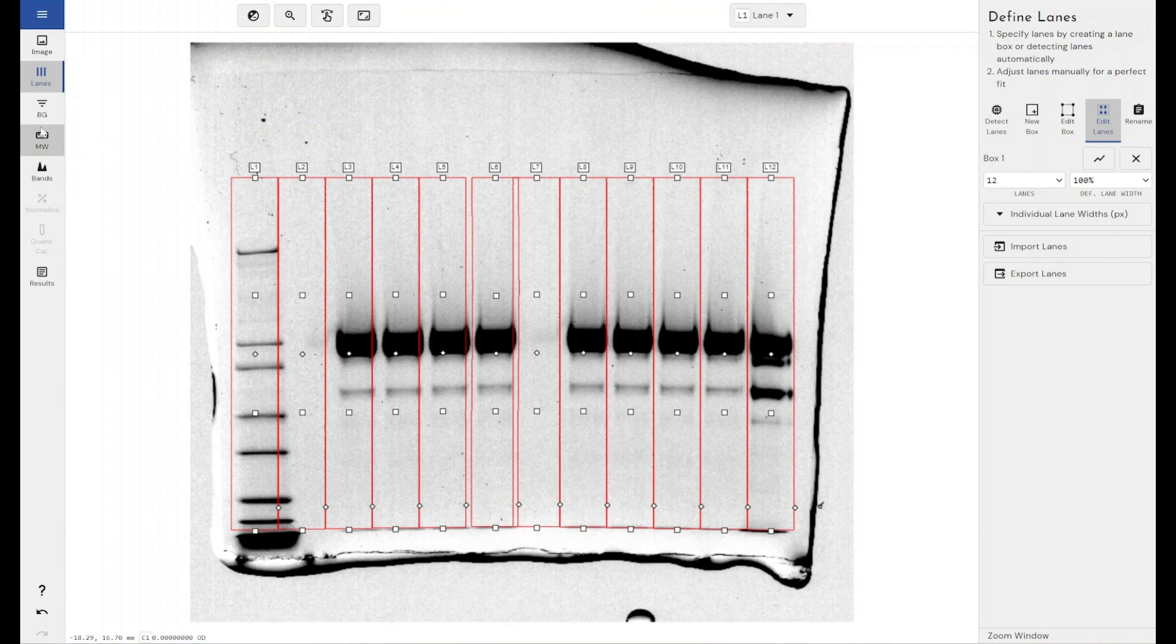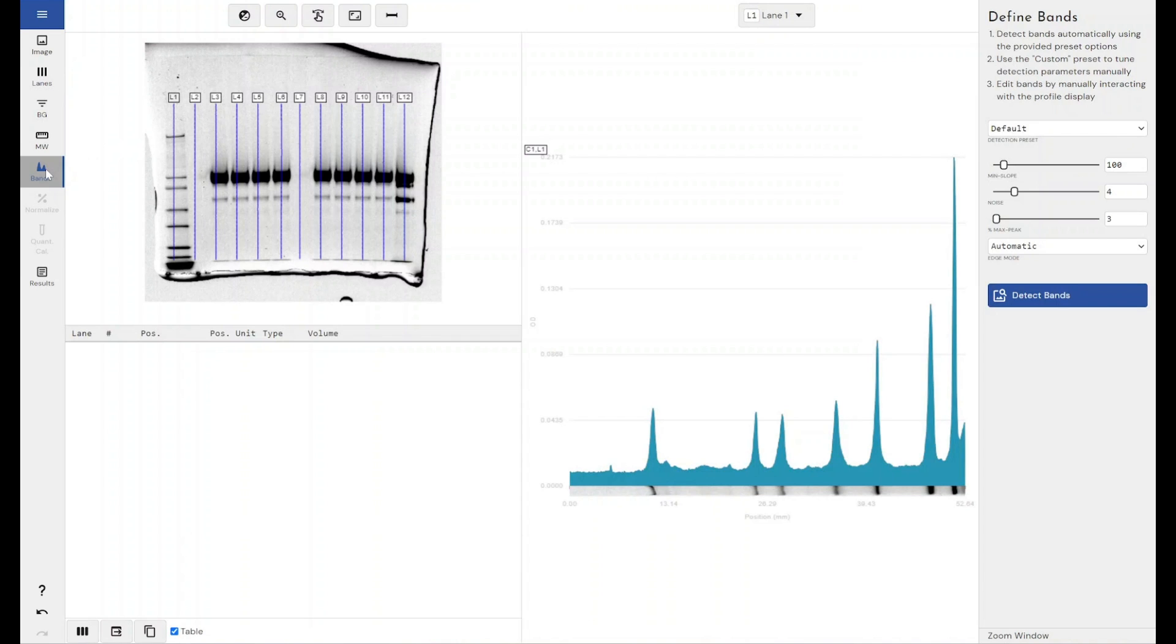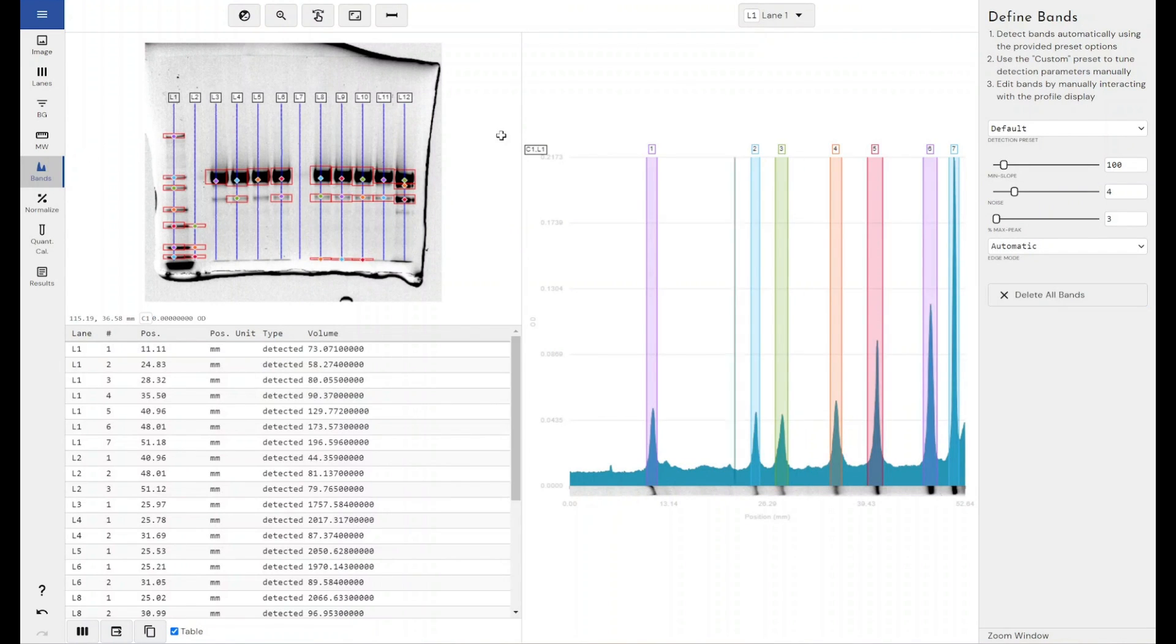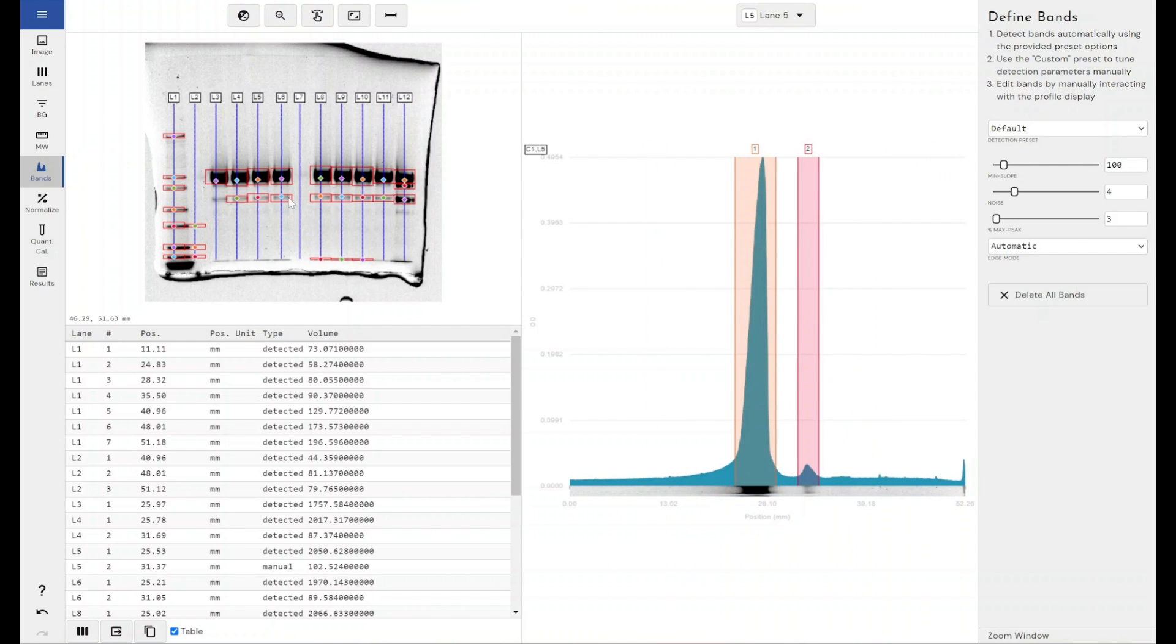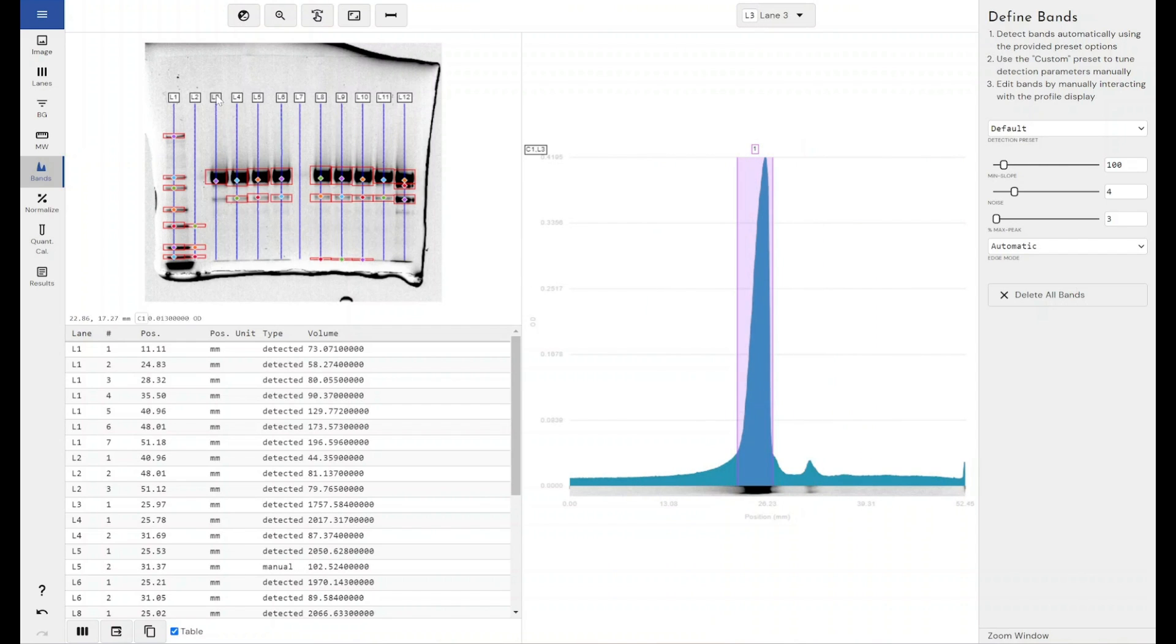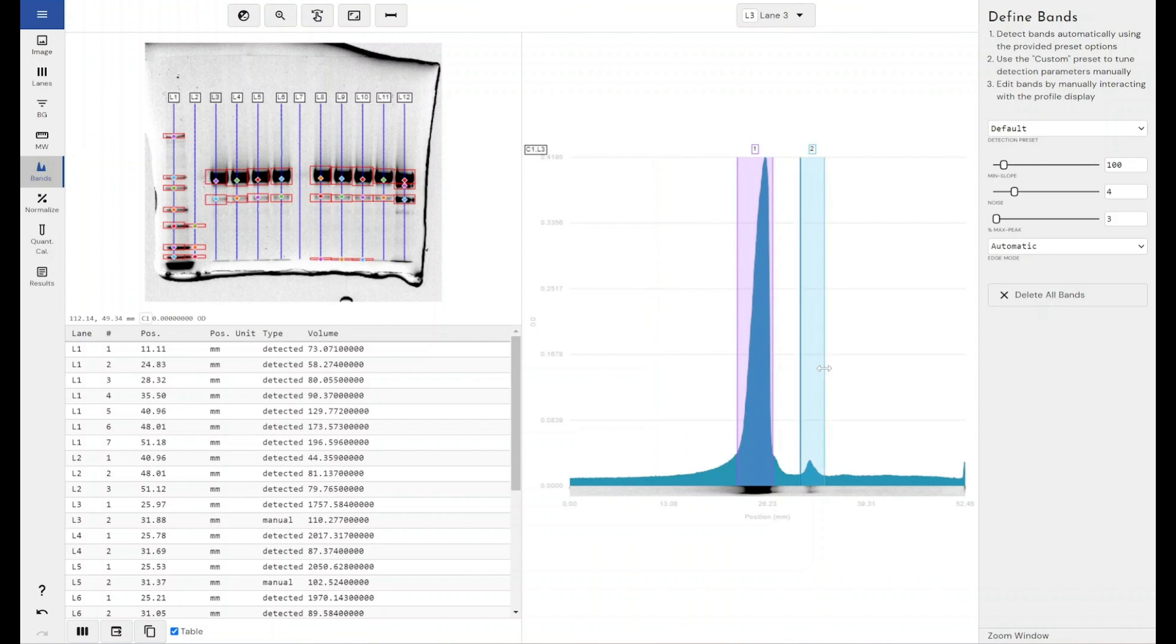So I can skip the background removal and the molecular weight steps for this. If I come straight through to my band settings, automatically detect my bands, add in the ones that are a bit too faint to be captured under these particular settings.